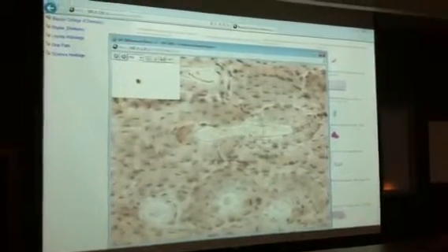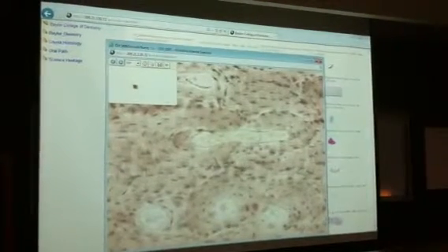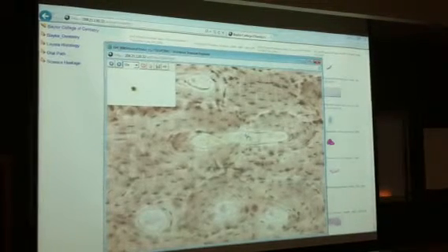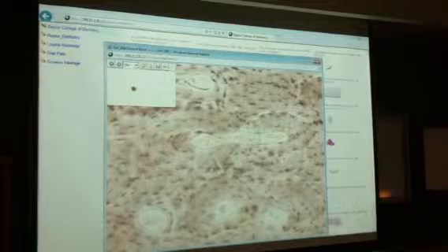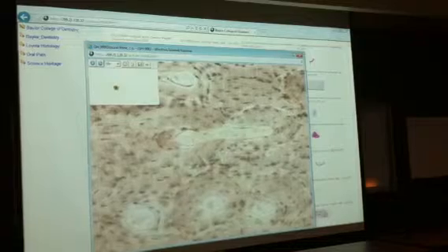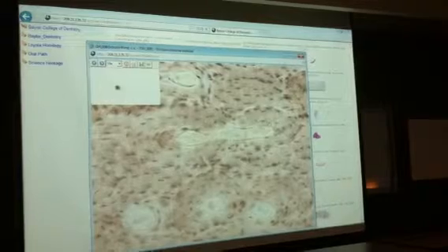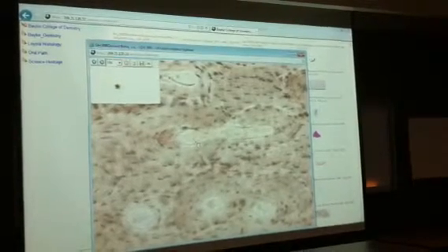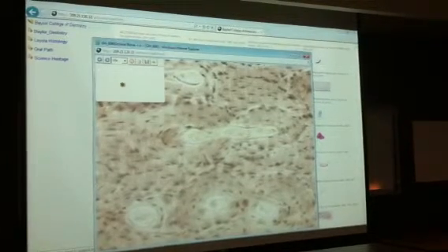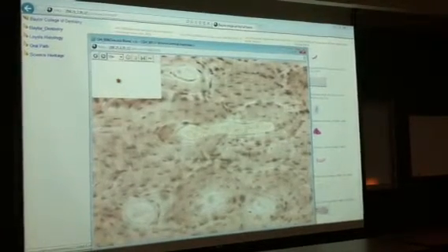Well, there's a thing that almost looks like a Volkmann's canal. Whenever you can see where you have one osteon or Haversian system, you have another. This cut kind of cut through the middle part. So when you see this thing connecting, instead of having just a Haversian canal, like here and here, here's one canal, here's another canal, but then it interconnects between the two canals. So the structure that interconnects the two canals, two separate osteons or Haversian systems, is your Volkmann's canal. Okay? This would be a Haversian canal, this would be a Haversian canal, Volkmann's canal.